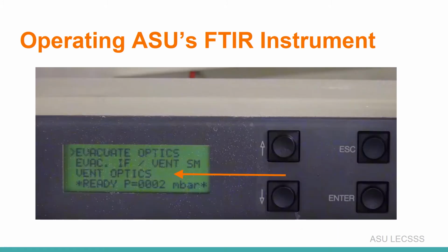So first, you're going to put gloves on, or not, it's your call. Remember that it should be under a vacuum, so you locate the pressure button, which is labeled as the letter P, and you check to make sure it's set really low. You perform a safety check to make sure everything looks good. So the nitrogen cylinder has the nitrogen that's actually supposed to be in it, and it's not empty. The beam splitter is installed, which you check by looking under the round lid. Make sure you note the color as to which one is being used: red, brown, yellow.